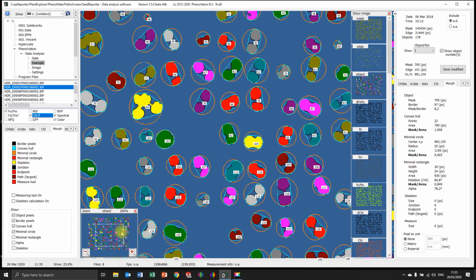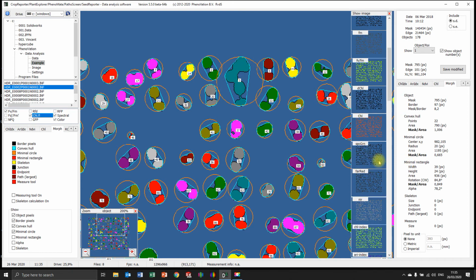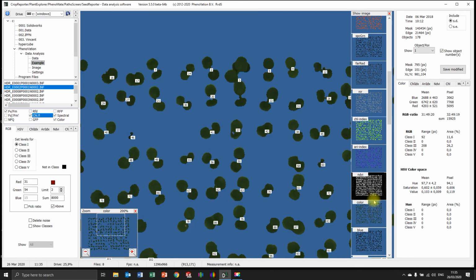But what you can also see here on the top, if plants are connected to each other, it doesn't work because it's based on pixel level. So if you want to measure multiple plants in the image cabinets, you should spread them out so they don't touch. In that way, maybe it takes more room for your imaging and also storage of the plants and growing them, but your analysis will be way easier.